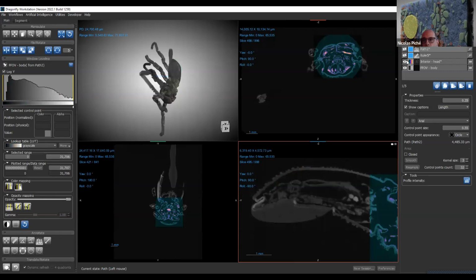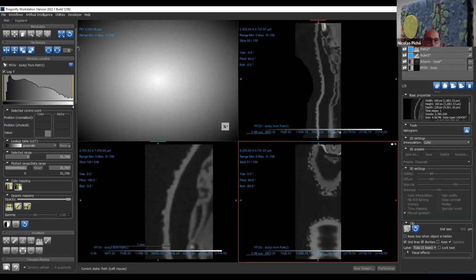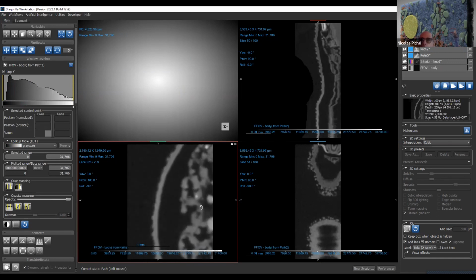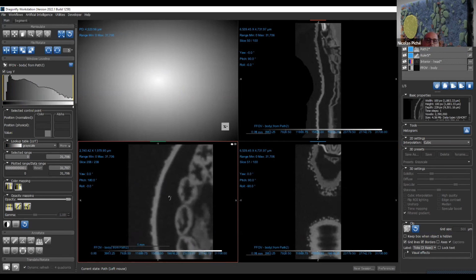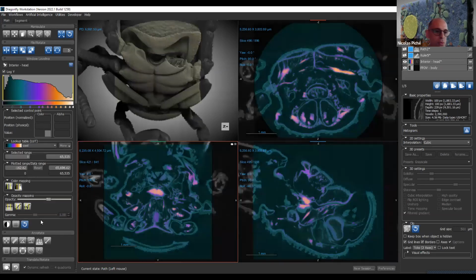So if I could show that data set and show you how it looked now, for that, I need to reset the view. And now in the axial view, I'm looking at the data as viewed from the path, as if I was in a buggy running on the path, you know? So that's what I would see. In medical software, often they have an additional function, which is a curve planar reformat that we don't have yet. We used to have, but it's kind of not very useful in your field. Okay, so I will go back to those two guys.